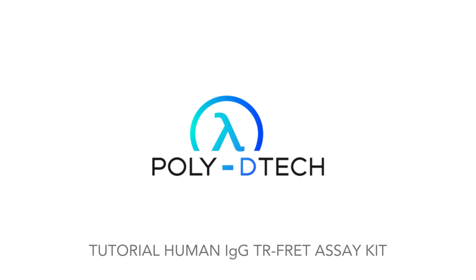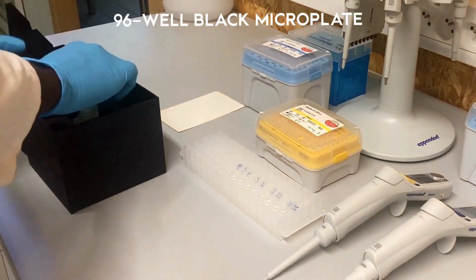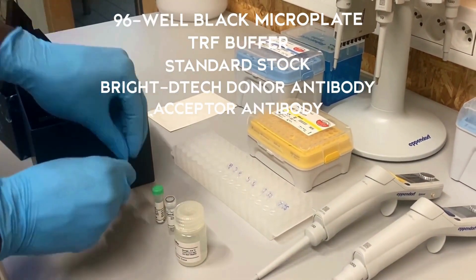In this video you will learn how to use your Human IgG Assay Kit based on TR-FRET method. The kit comes in a box containing a 96-well black microplate, TRF buffer, standard stock solution, Bright-Dtech donor antibody solution, and acceptor antibody solution.